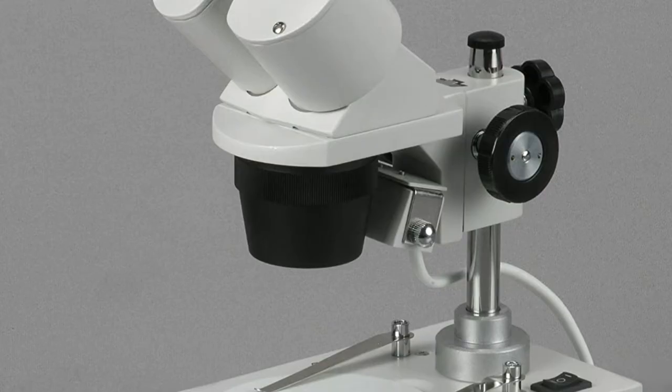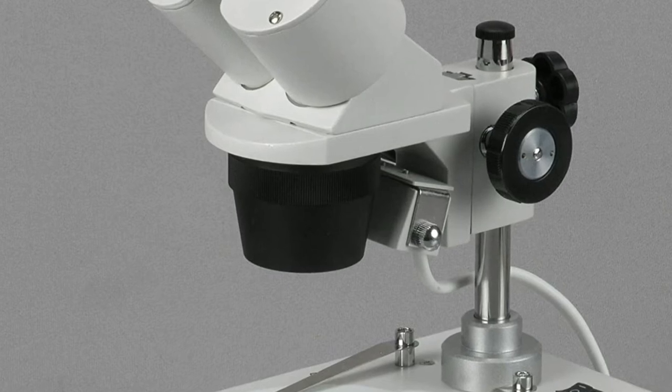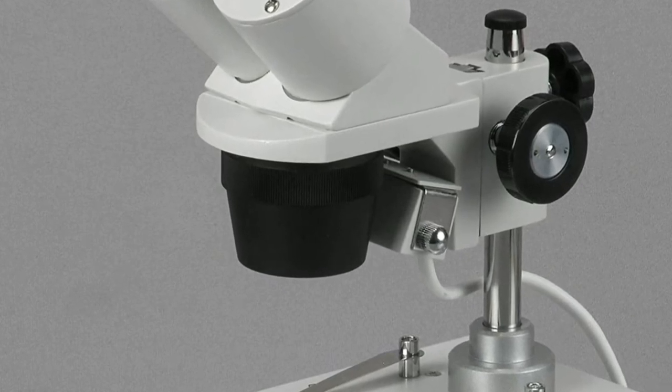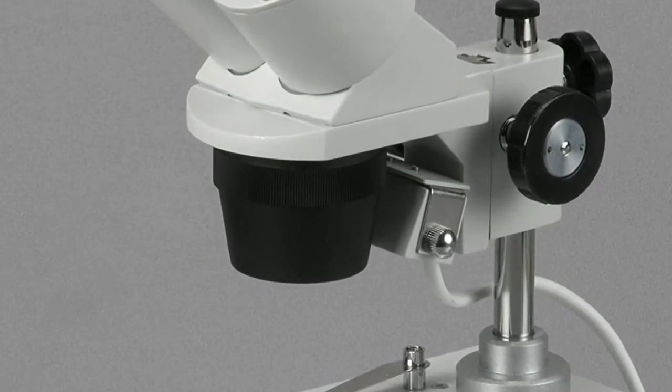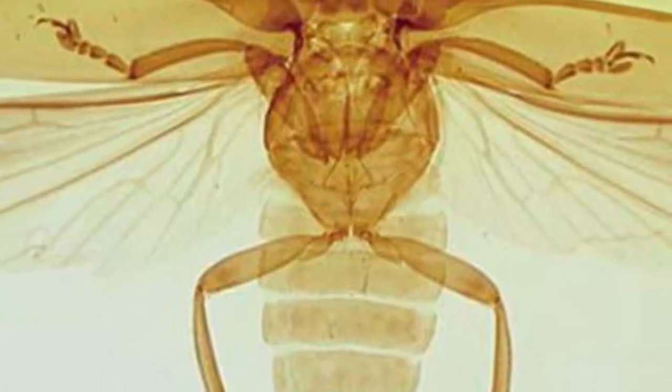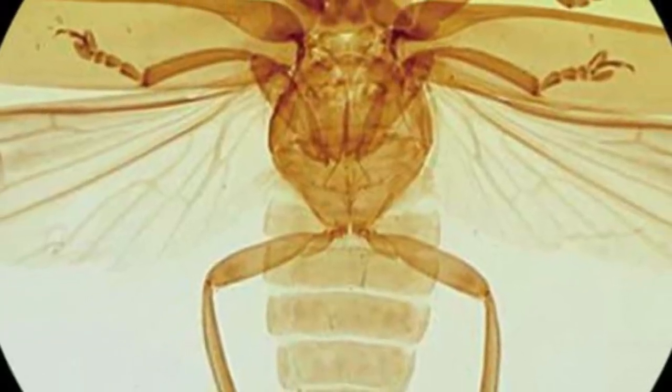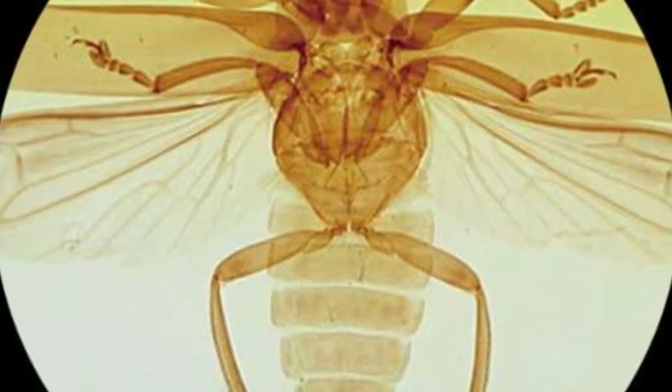Who often observe the finer details of objects to either repair them or determine their authenticity. With the AMSCOPE SE306RPZ forward binocular stereo microscope, dioptric adjustment is also possible, which allows it to accommodate individual eyesight strength differences.